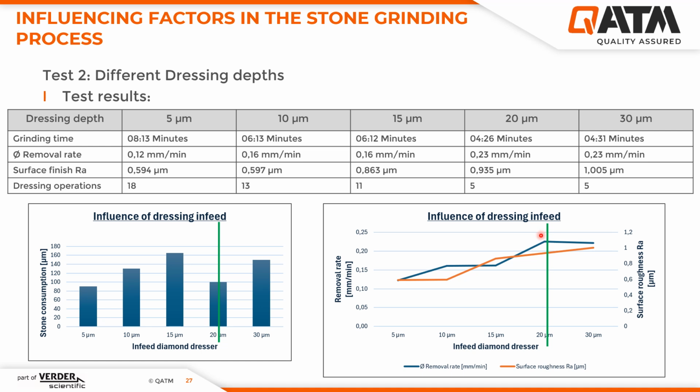Since the dressing depth is also directly related to the stone wear, I was able to decide easily that the dressing depth of 20 micron is the best for my sample material and my sample size.